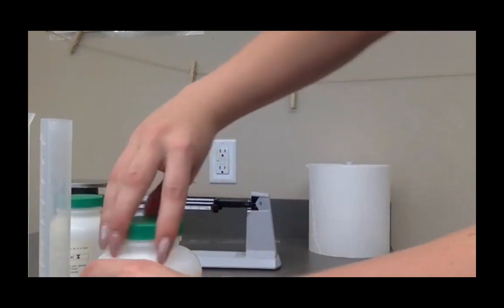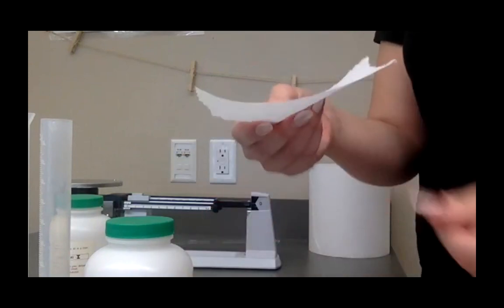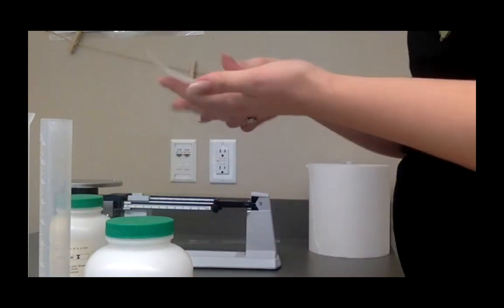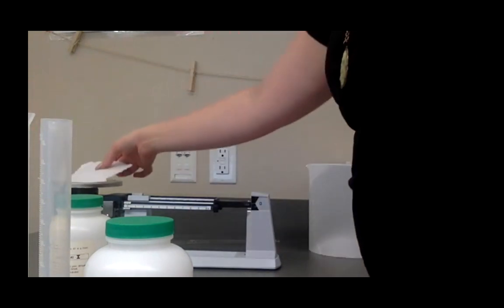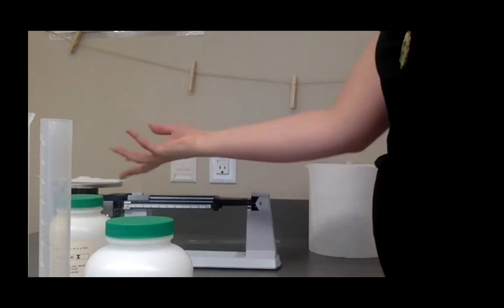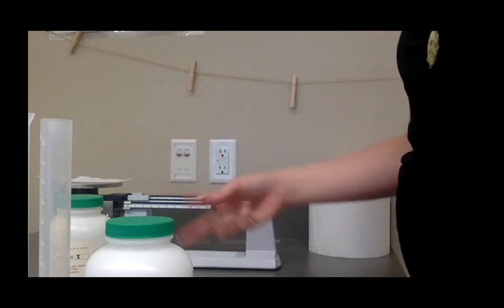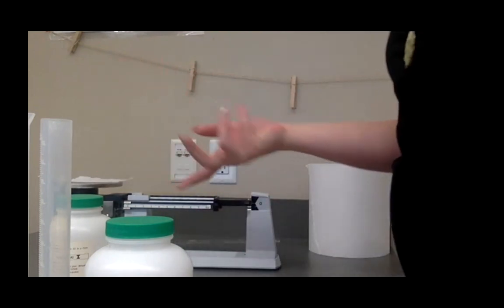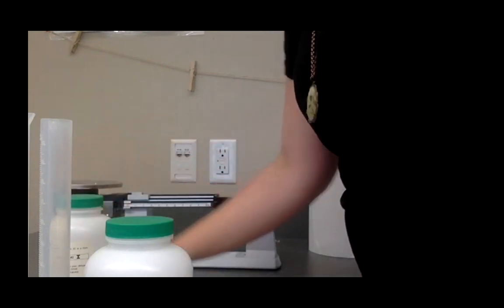To measure the mass of this, you guys are going to be using a little piece of paper towel as the base so that you're not just putting it directly on the balance. So you might want to weigh the paper towel first. It might have a negligible mass, meaning that it's so small it doesn't pick it up, in which case that's fine. You could just put the substance straight on. If we were using a cup or something like that, you would definitely want to make sure you measured the mass of the cup first.